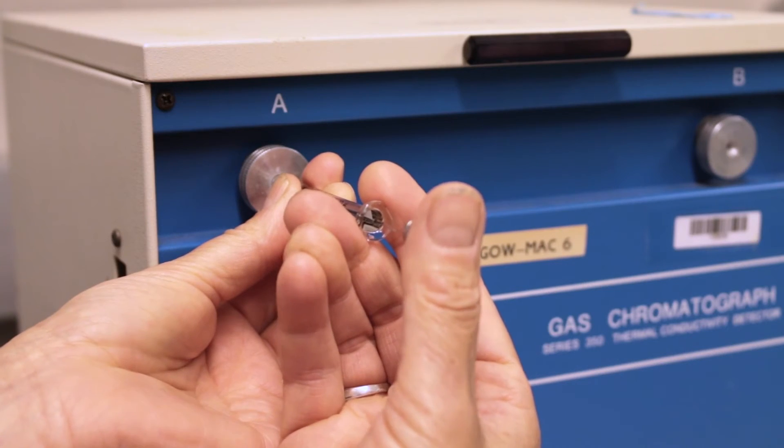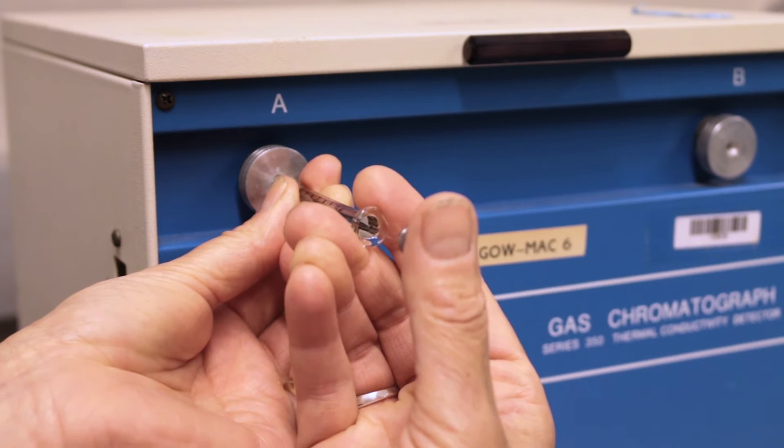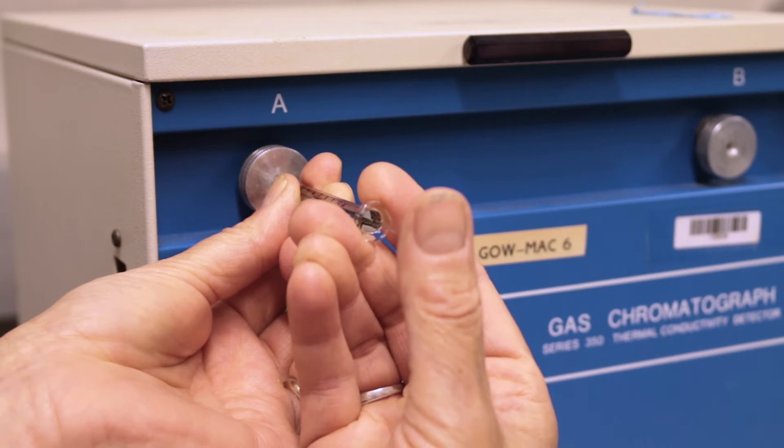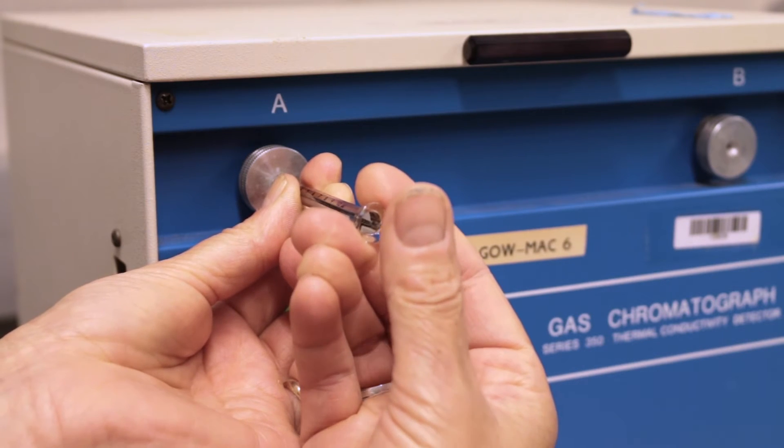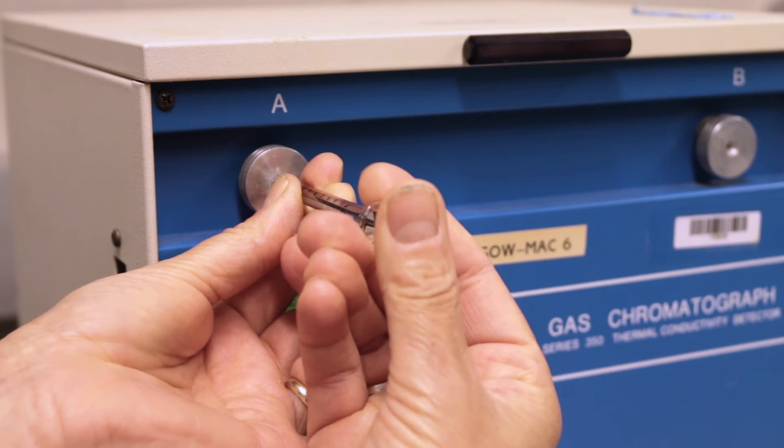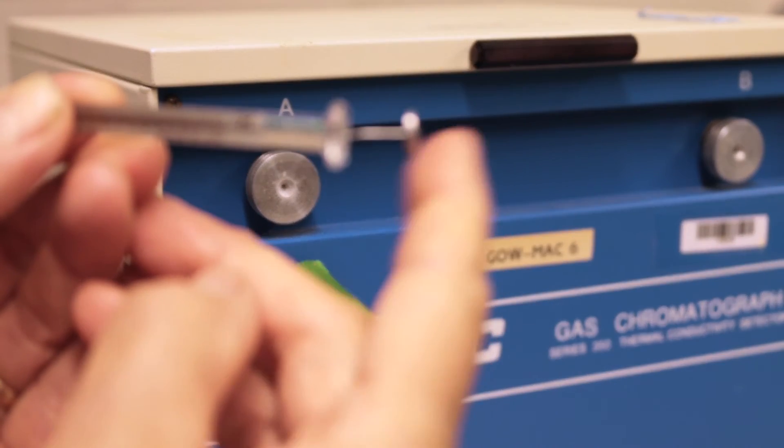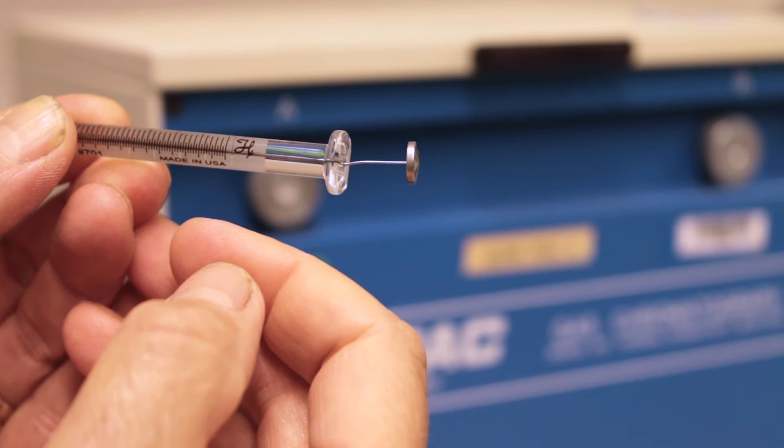Keep your thumb positioned behind the plunger while doing this because sometimes the heat and gas can blow the plunger back at you out of the syringe. Once the barrel hits the port, use your thumb to depress the plunger, injecting your sample onto the column. Remember, the plunger does not end up flush with the barrel when fully depressed.